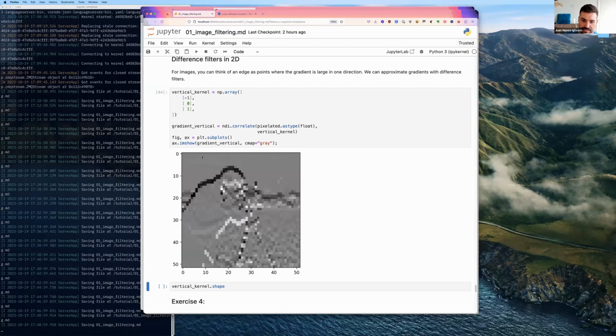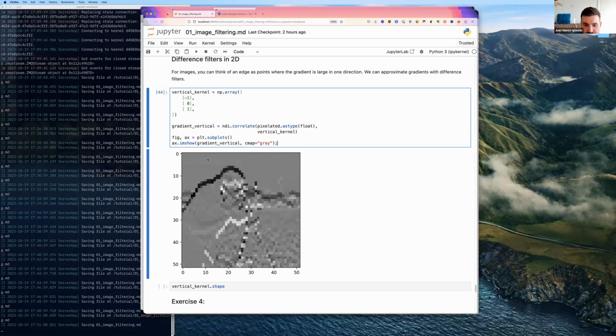You can see that you get, it's probably better, oh, I always forget how to add a color map. So the values around here are 0. This is the sky that we saw, so it's not changing very much. Then it goes from bright sky to the dark suit or coat of the person, so the values dip down.